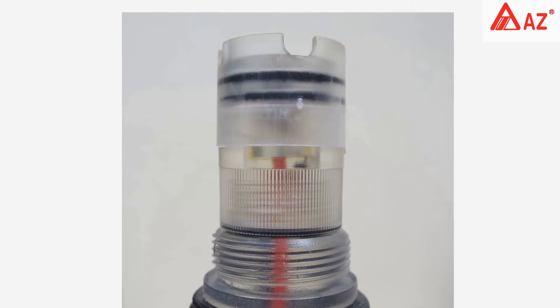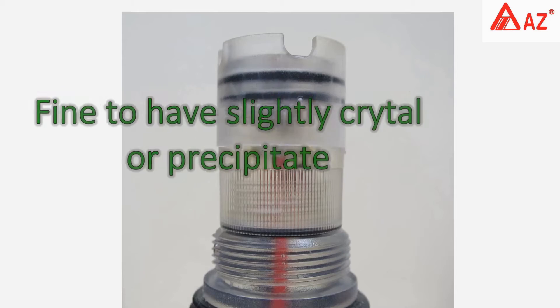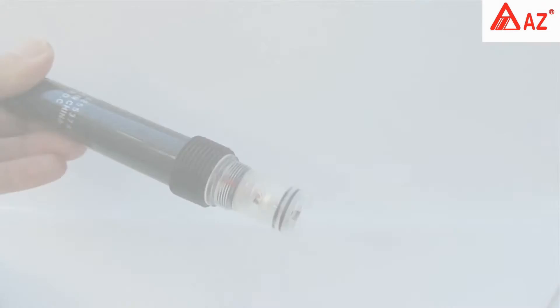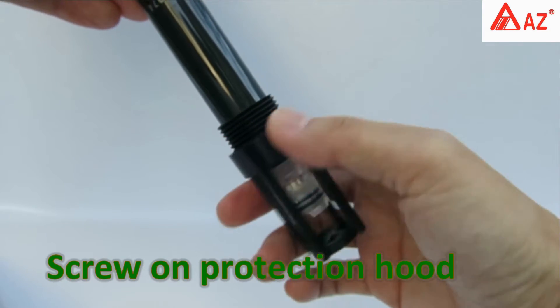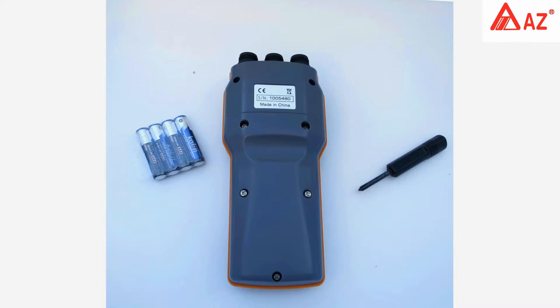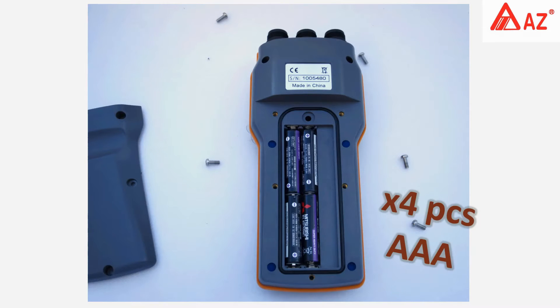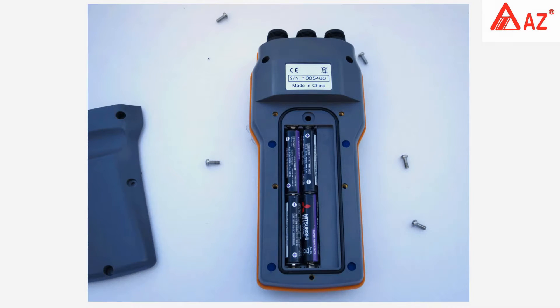Check that the electrolyte is more than half height — it's fine to have slightly soft crystals or precipitate. Screw on the protection hood after inspection. To begin testing, open the cover with a screwdriver and insert four triple-A batteries.